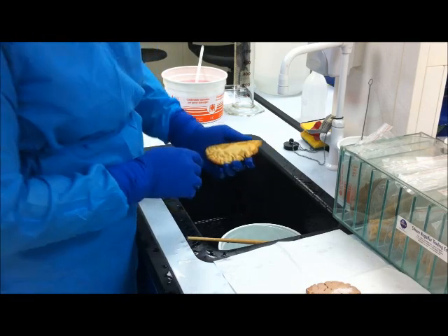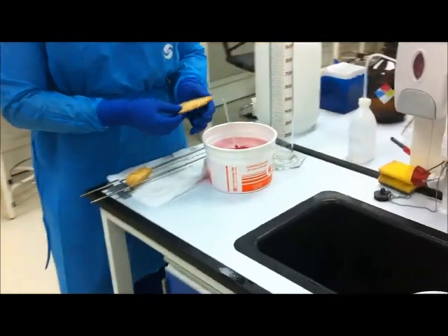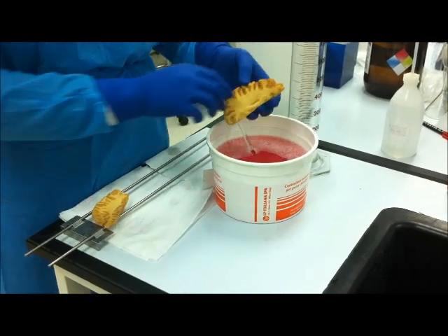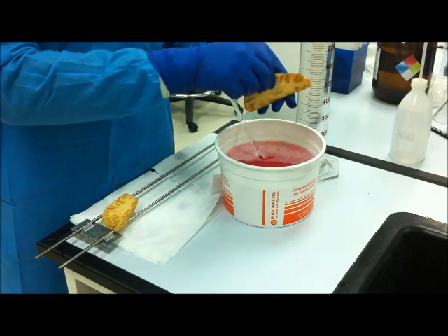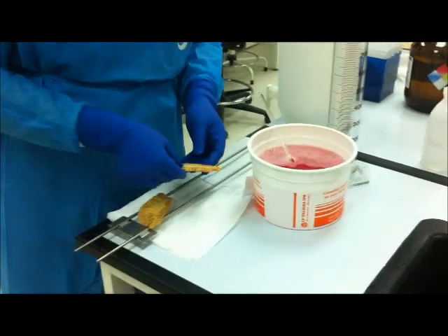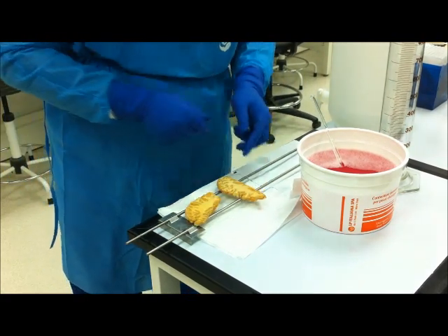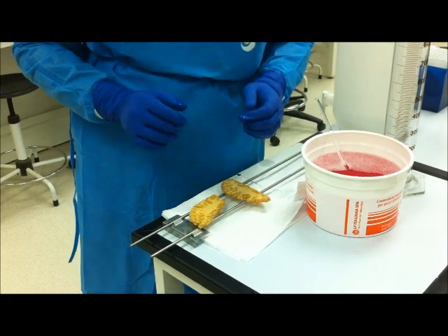Now it's time to disinfect using a 3% vercon solution — that is 30 grams of vercon powder for each one liter. This will help us disinfect the brain slice from any leftover fungus, if there is any. After a few dunks, we place it on a holder to wait for it to dry. It takes about one to two days to finish drying.